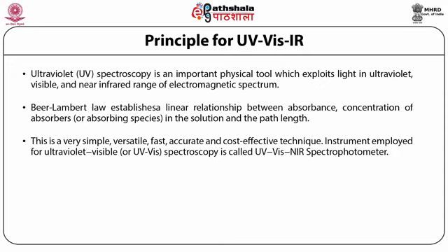This is a very simple, versatile, fast, accurate, and cost-effective technique. The instrument which is employed for ultraviolet visible or UV-Vis spectroscopy is called a UV-Vis NIR spectrophotometer.